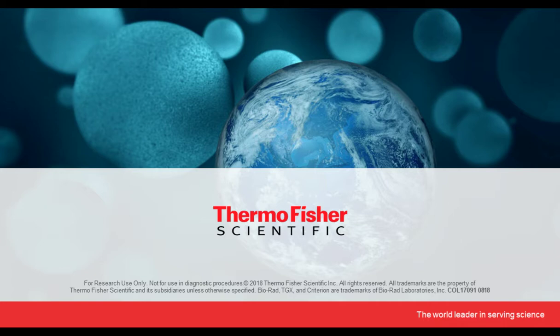Great, thank you. The next one is, sometimes the protein bands in some of my gels are not straight and well-defined, but are irregular or wavy. What can cause this?